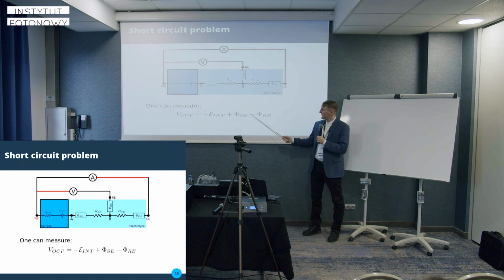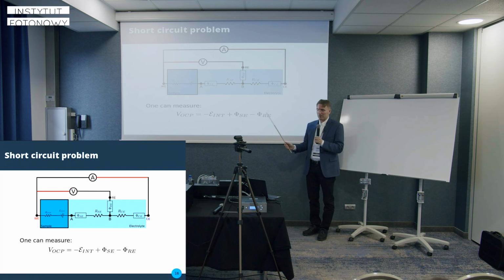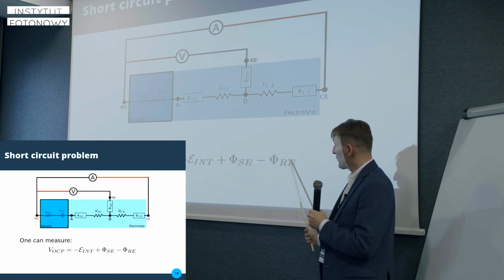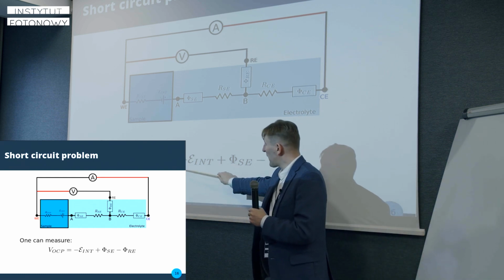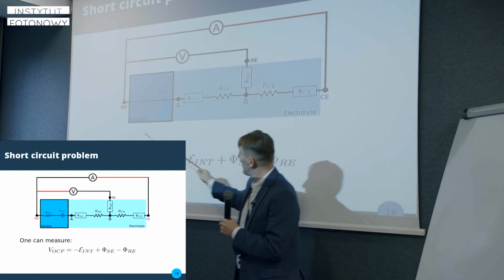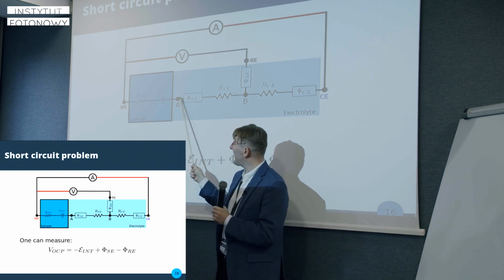Those come with a difference, because depending on which way you go, you can adjust those pluses and minuses here. But the sign between them should always be minus. So you need to subtract those 2 things, never add. But so this is V_OCP. So we know what is the voltage between this point and that point. But we are interested in the voltage between WE and point A.